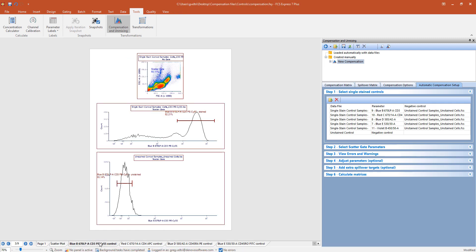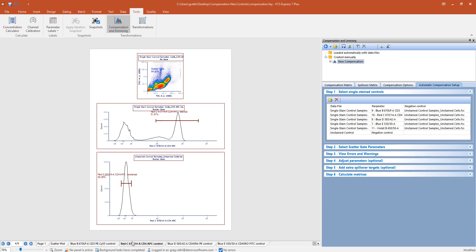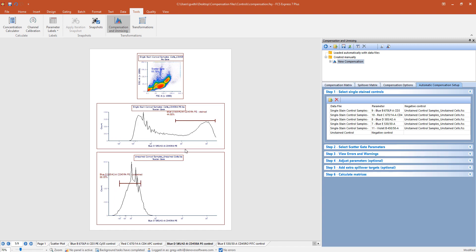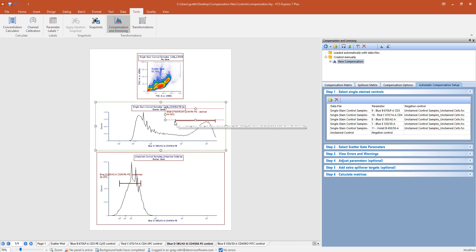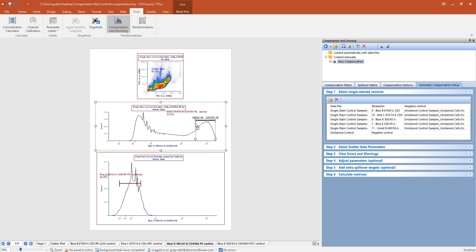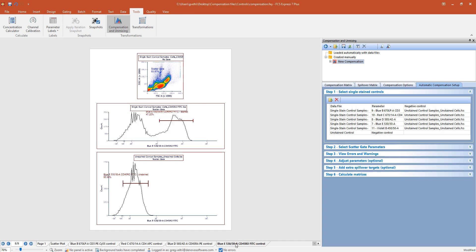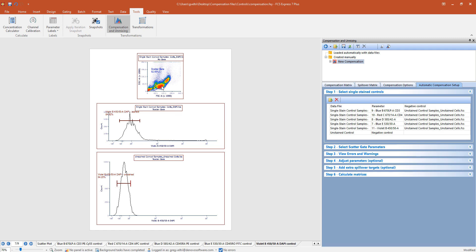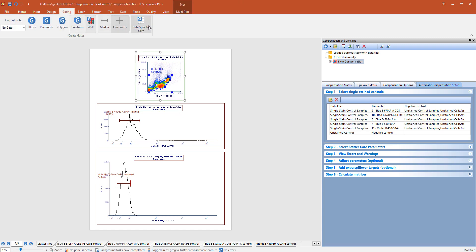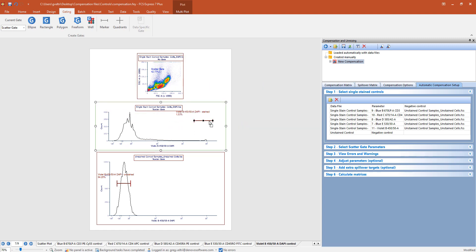With FCS Express, once you have single color and negative control files loaded in the wizard, individual pages will be automatically created for scatter gating, for each single stain control, and separate pages for spillover spreading and cross-stained index matrices will also be automatically created. Your compensation is already complete if no updates to the gating are needed, but we do recommend reviewing all tabs and gates. We have navigated through each tab to evaluate how well the automatic gating for each compensation control was performed and made adjustments as needed.